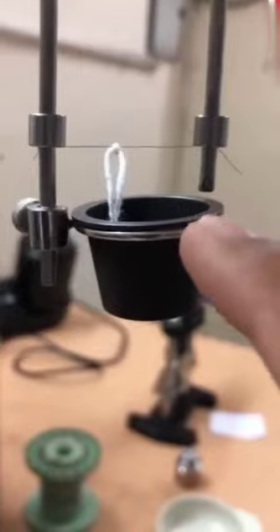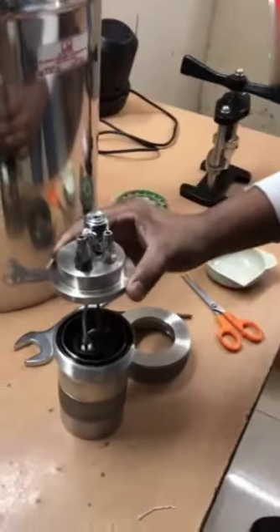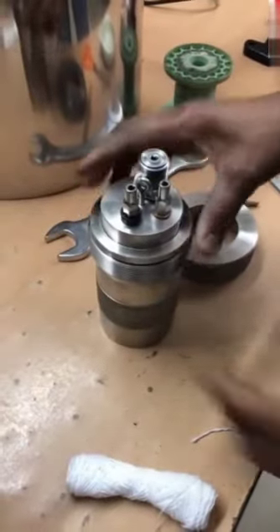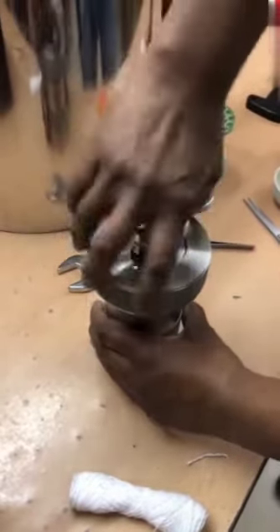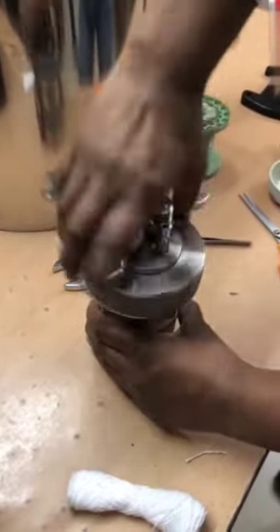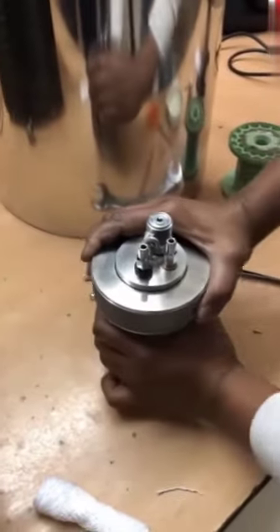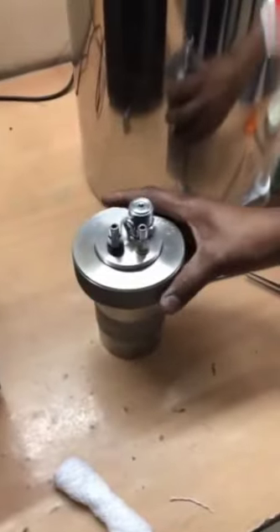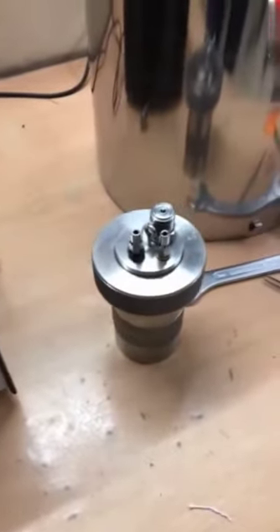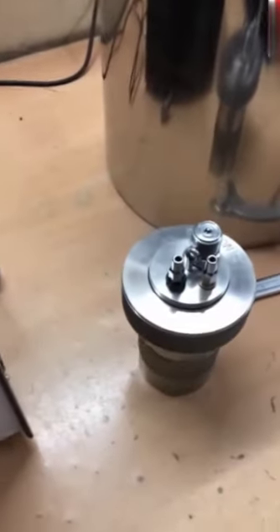See, there is a gap. Now we will keep the lid inside the bomb and tie the closure ring. Now we have to fill oxygen in this bomb. So far we have: wetted the sample, kept it inside the crucible, tied the ignition wire, and tied the cotton thread. Now we have to fill oxygen in this bomb.